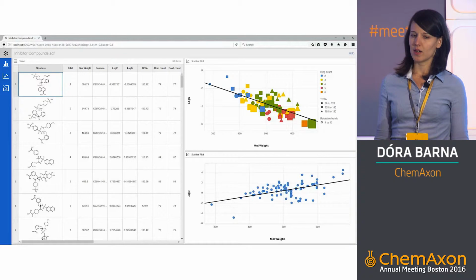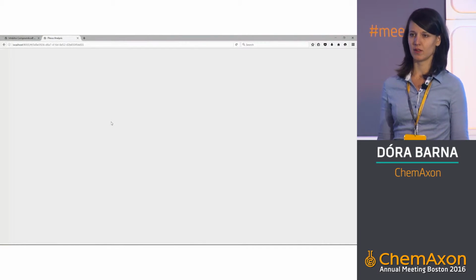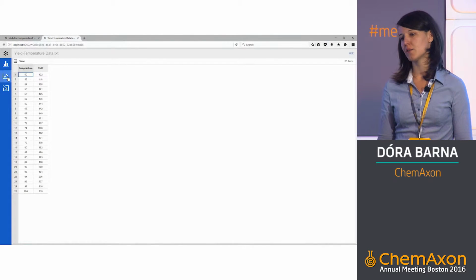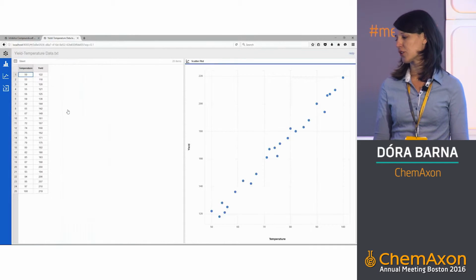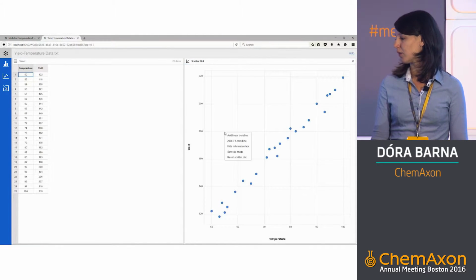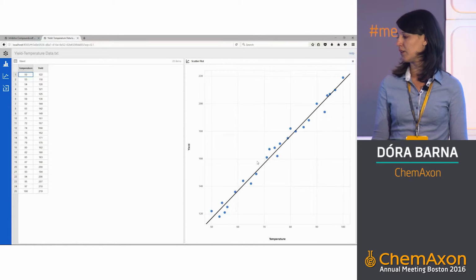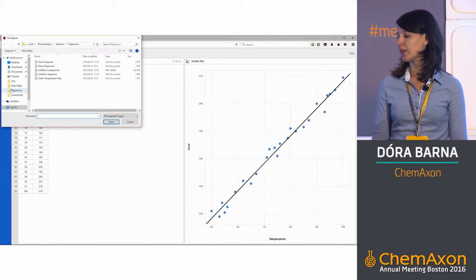Alternatively, if we are interested in the parameters of best fitting straight lines, so the slope and the intercept, in order to make further predictions to further values, then after we have fitted the linear trend line, we can use the tooltip of this line and get the slope and the intercept from there.